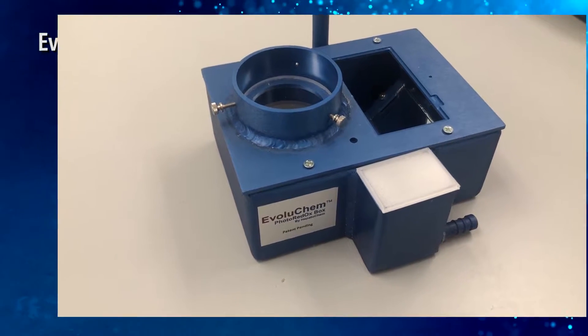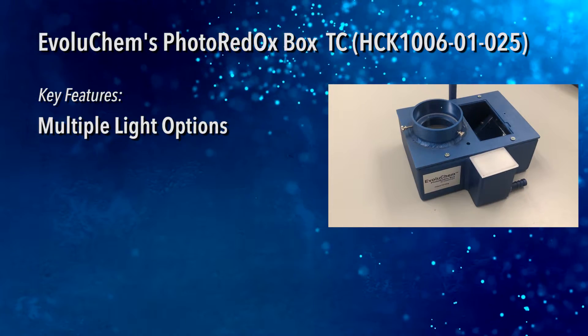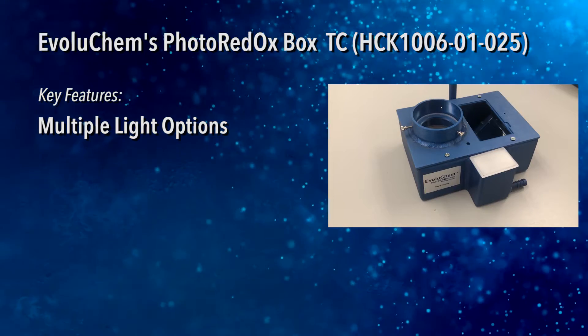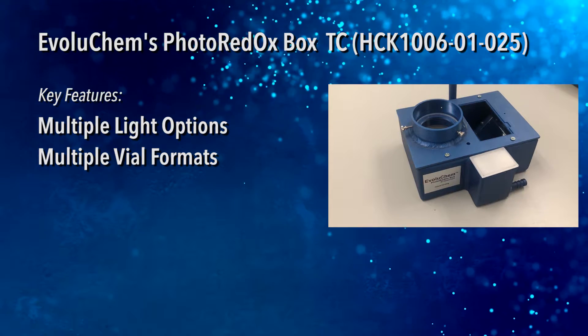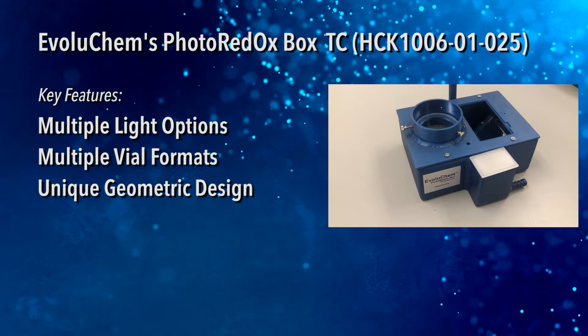Key features include: the Photoredox Box TC accommodates most light sources, including a large selection of AvaluChem brand options. Vial holders are available for 20, 8, 4, 2, and 0.3 milliliter formats. The unique chamber geometry evenly distributes light.